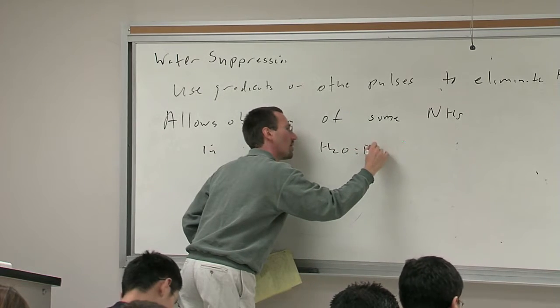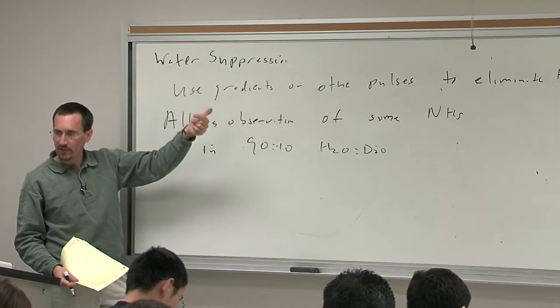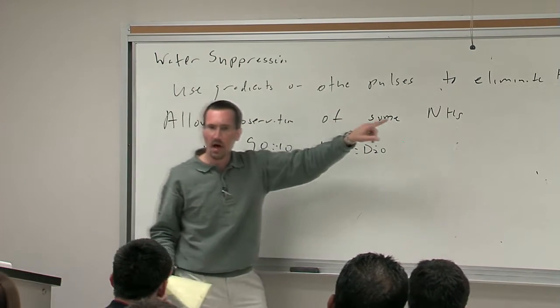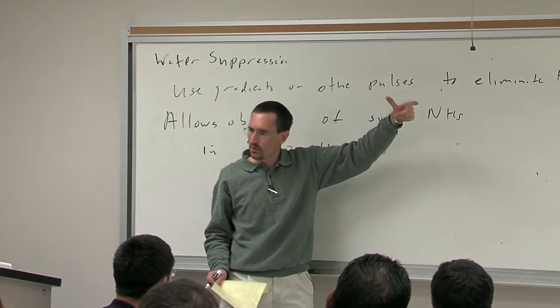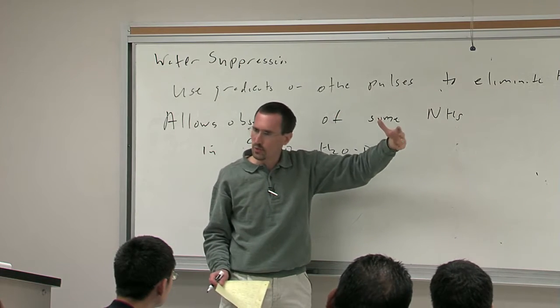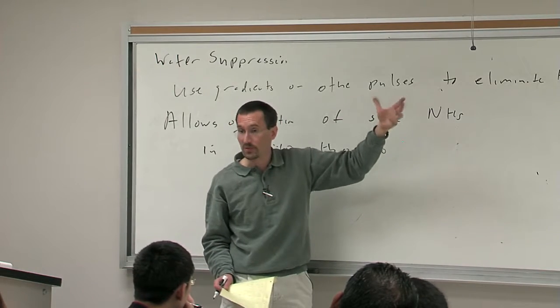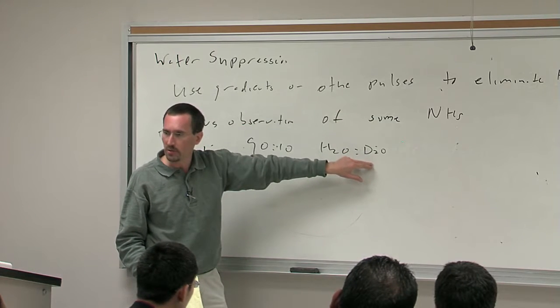H2O D2O, because on the laboratory time scale, that's the third time scale, so we have uncertainty principle, relaxation, laboratory time scale. On the laboratory time scale, if you dissolve an amide in pure D2O, the NHs exchange with deuterium, as do the OHs very quickly, in fact. The NHs exchange with deuterium, and you can't see them. So you can never see protons on a heteroatom in D2O. Never, I won't say never, but you almost can never. So you take the spectrum in water with just a little D2O for the lock.